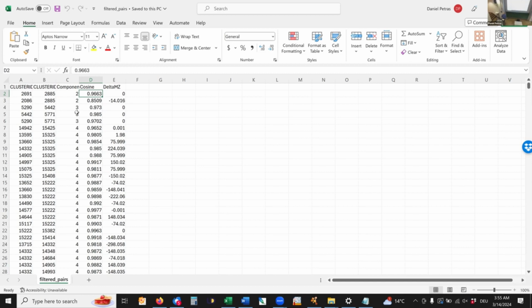So now we want to make things easier for you and just provide you a file you can drag and drop. But I think it's also important to understand the data structure behind, because then you can come up with new visualizations. And ion identity networking, for example, like Stefan also highlighted, builds up on this concept. Now, in addition to these MS2 similarity edges, we now also have these coelution profiles, which we call ion identities, that we can bring in there.